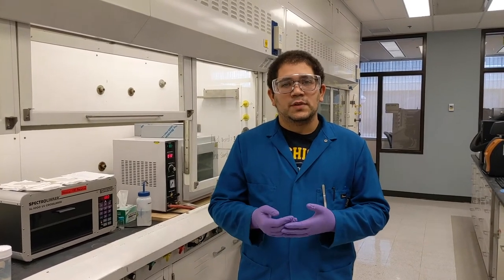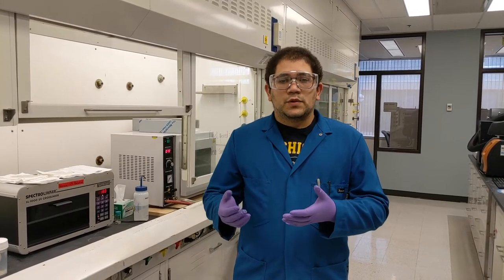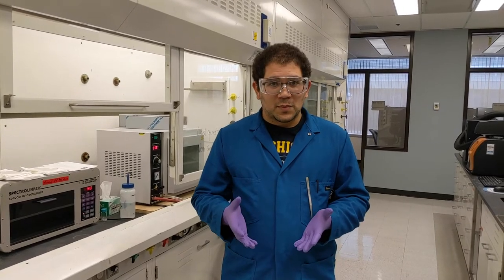Hi, welcome to the Kamcev lab. In this lab, what we do is we work with polymer membranes, and we want to try to find applications of these materials in fields of society, basically trying to make these materials to be used in desalination plants and electrodialysis membranes. And today we have a demo for you, and we're going to make a polymer membrane.